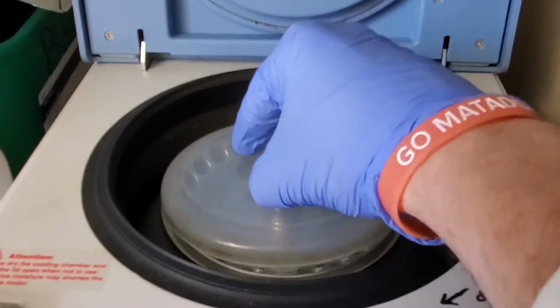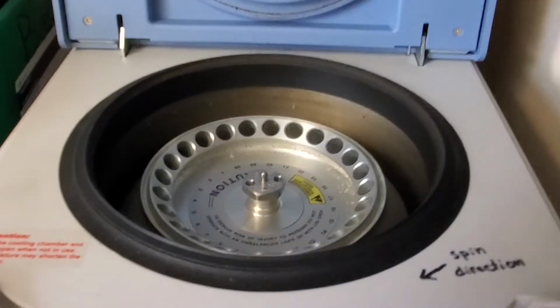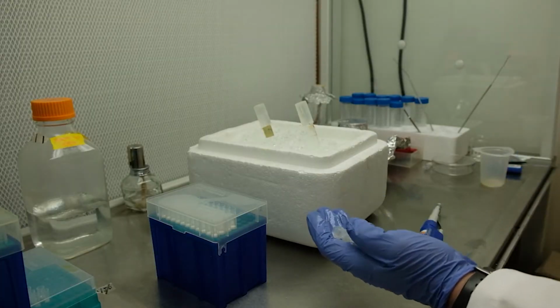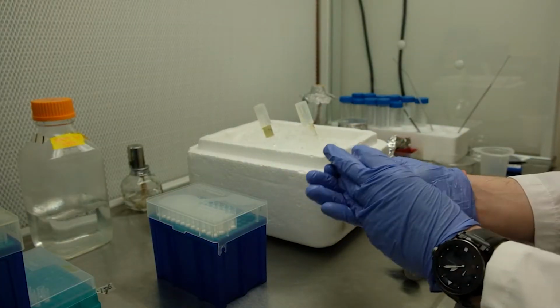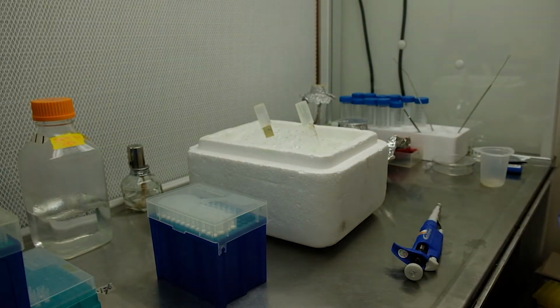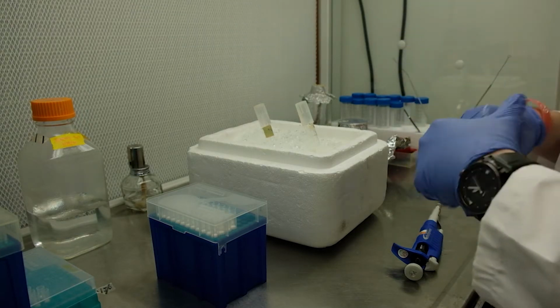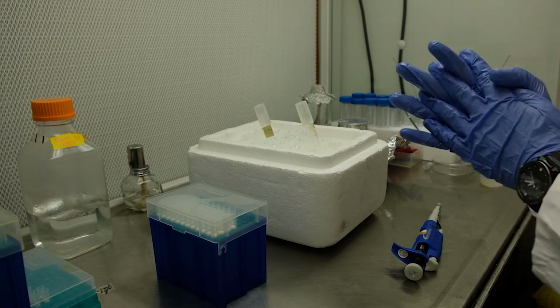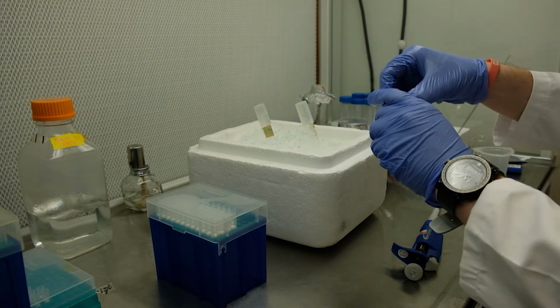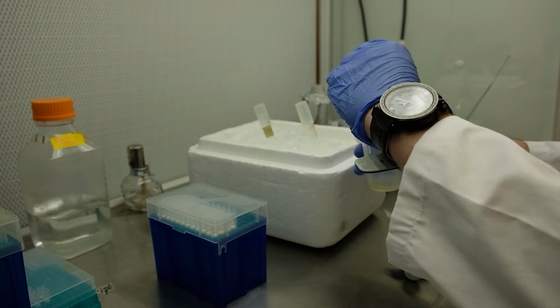When the centrifuge is done, retrieve your samples. Spray them with ethanol to disinfect, and put them on ice right away. Next, you will need to discard the supernatant while leaving the pellet on the bottom of the tube. You can do it either by aspirating with a pipette or just decanting like I do in the video.